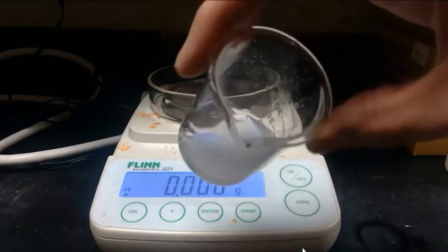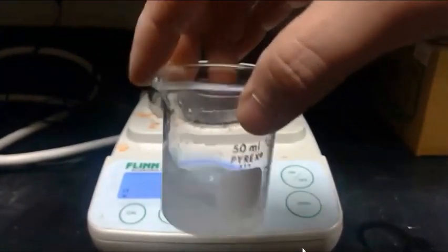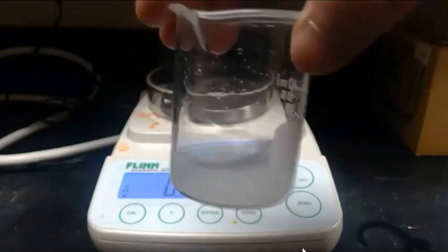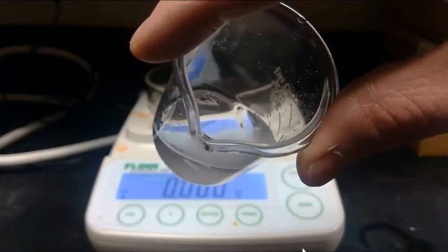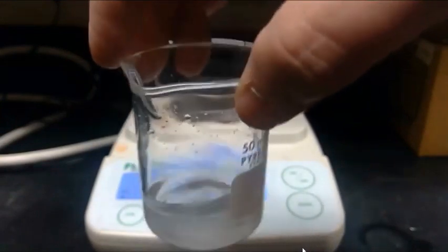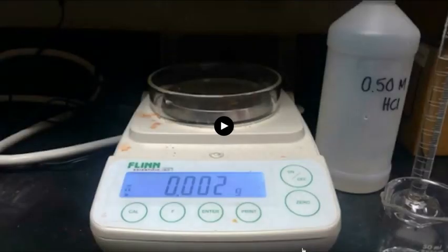Finally, we need to let the reaction finish. Since a gas is being produced, we'll know the reaction is done when we see no more production of gas, no more dissolving and formation of carbon dioxide. Your job is to figure out the limiting reactant. Sometimes there's visual clues that can tell you what's fully consumed and what's remaining at the end. So you might want to look at that beaker carefully and think about, is there a way I would know what the limiting reactant was? And finally, record the mass of your beaker and products.